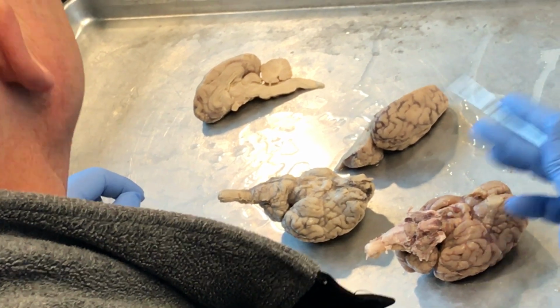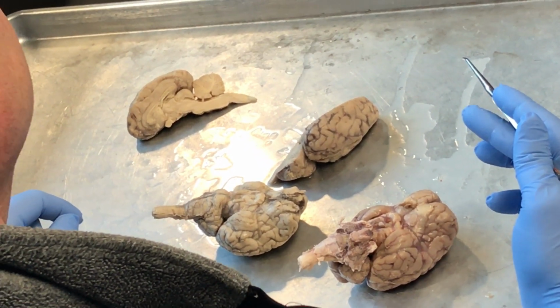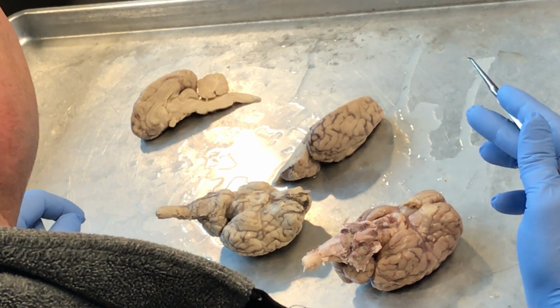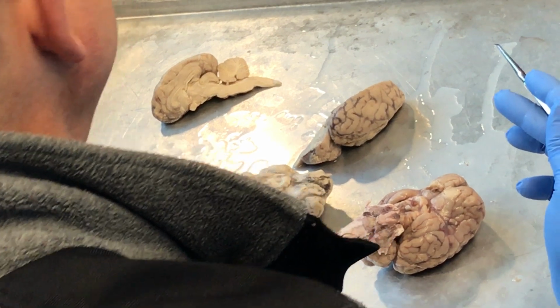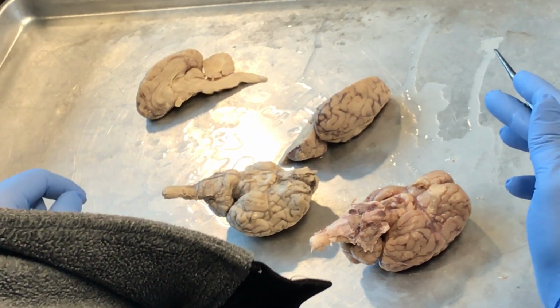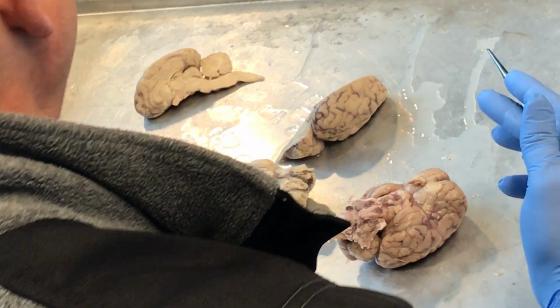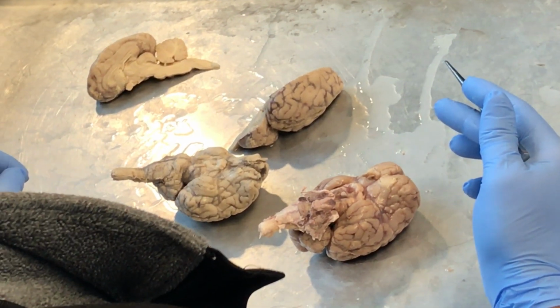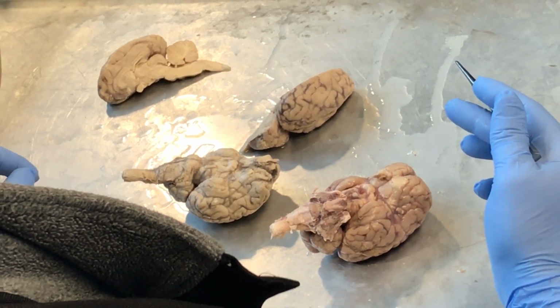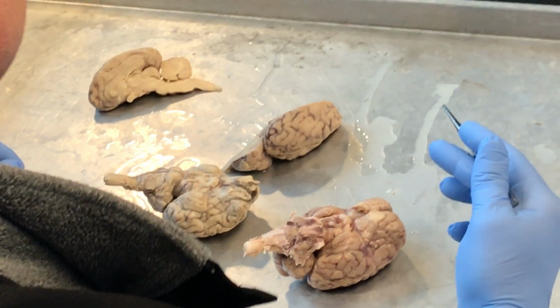Keep going back. I think I saw something. All right, so I don't know what it is. That's 17. Okay, so go back one more page for me. All right, that page right there. What page is that on your right-hand side? What page you have right there? 293. Okay, so stay right there for me.